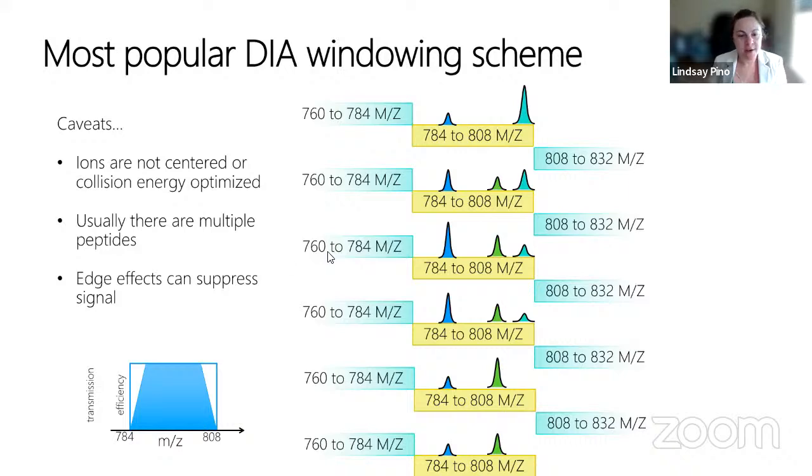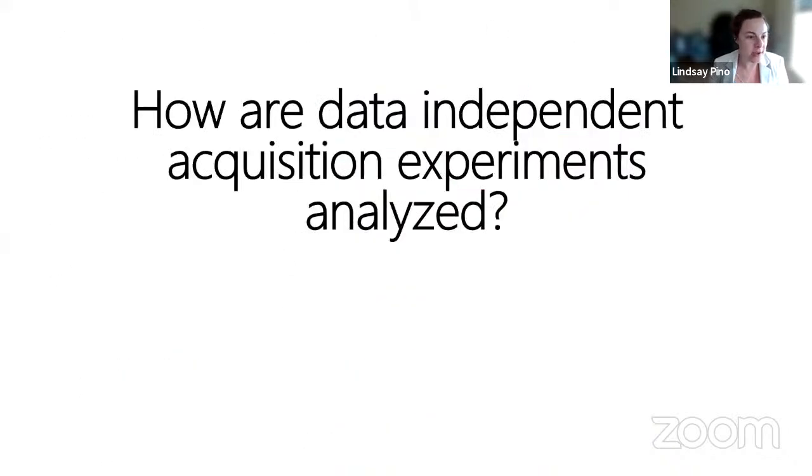So this is a good spot for me to stop and take some questions before we go to the next session. So Angel has a question. What is the resolution for this scan? The resolution you choose depends on your instrument.